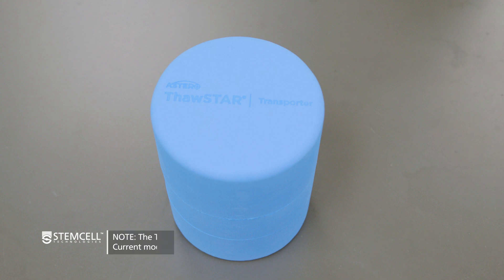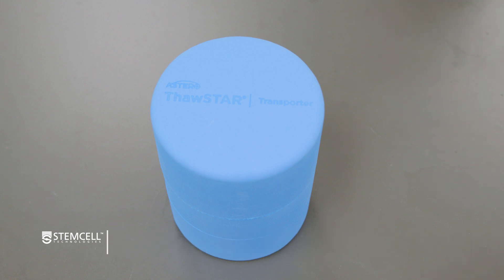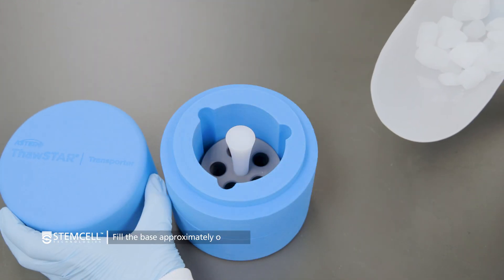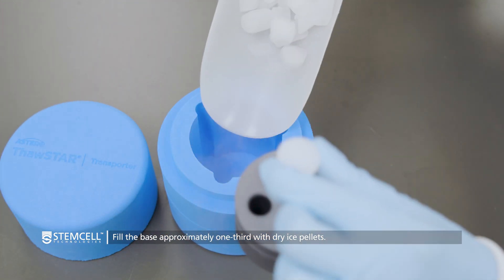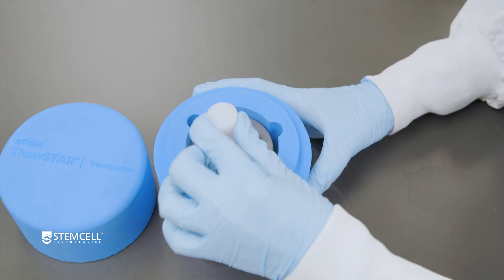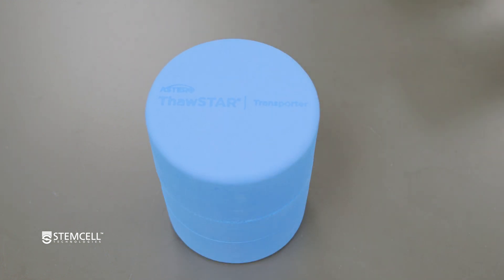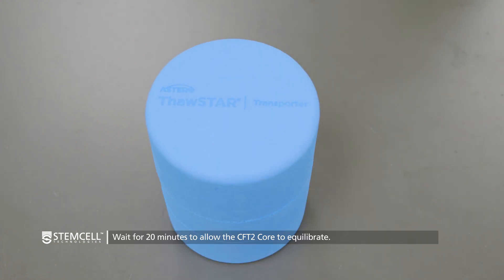To start, prepare your Thawstar CFT2 transporter to protect your frozen cells during transfer from long-term storage. Remove the lid and fill the base approximately one-third with dry ice pellets. Place the CFT2 core on top of the dry ice in the center and then firmly place the lid back onto the base. Wait for 20 minutes to allow the CFT2 core to equilibrate.